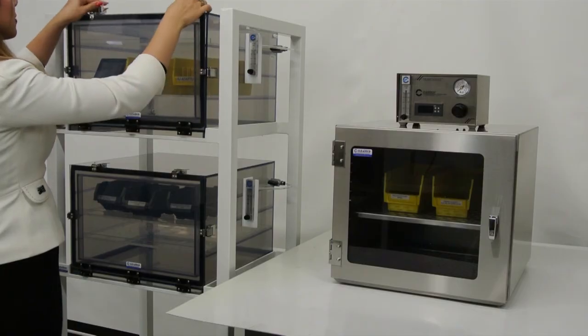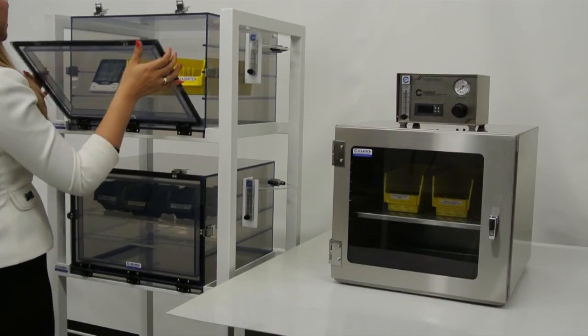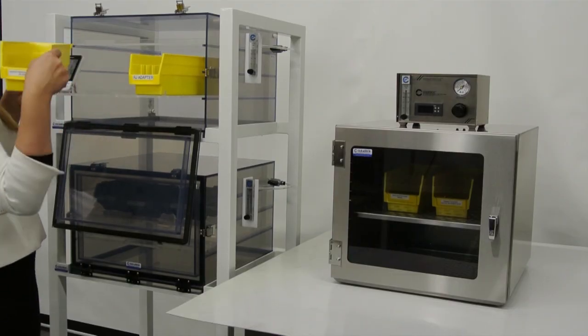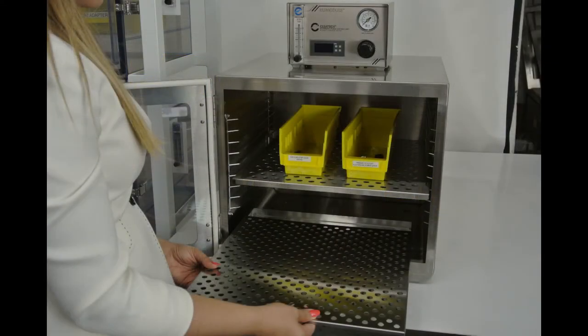Plastic and stainless steel shelves are available to maximize storage capacity. Epoxy powder-coated steel stands with optional casters can stack up to four chamber cabinets. A stainless steel desiccant tray with perforated lid is available for using silica gel.